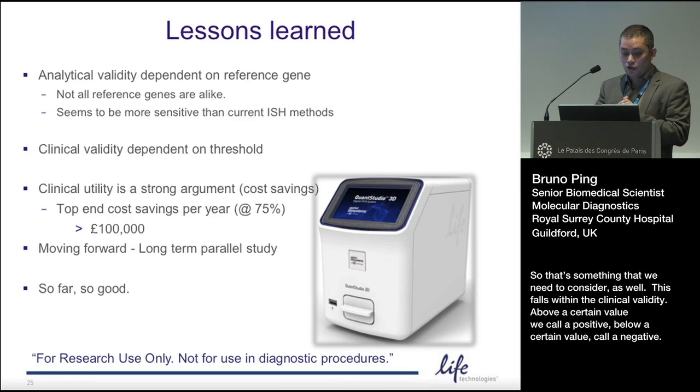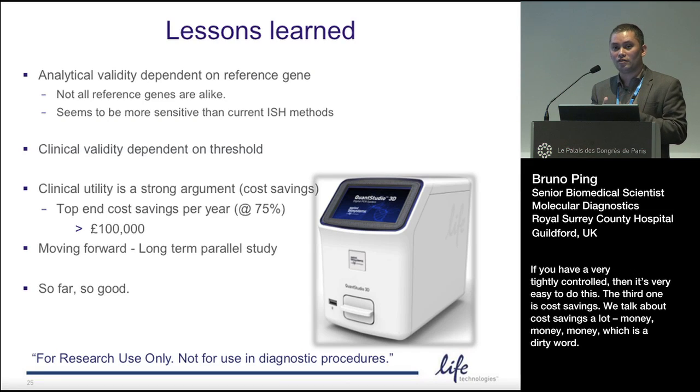And this falls within the clinical validity. Above a certain value, we call it positive. Below a certain value, we call it negative. If you have that very, very well tightly controlled, then it's very easy to do this.